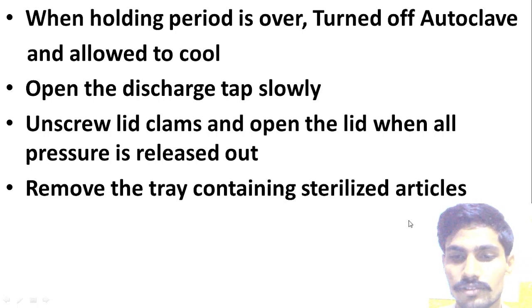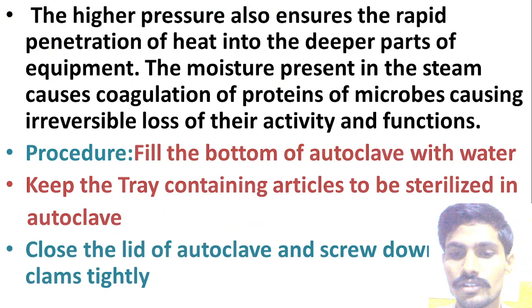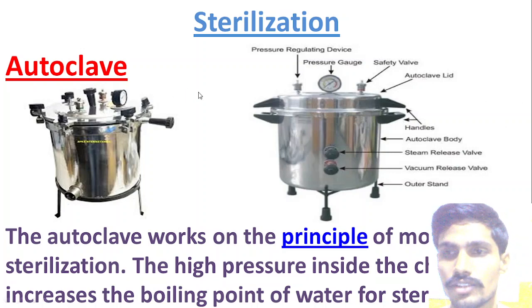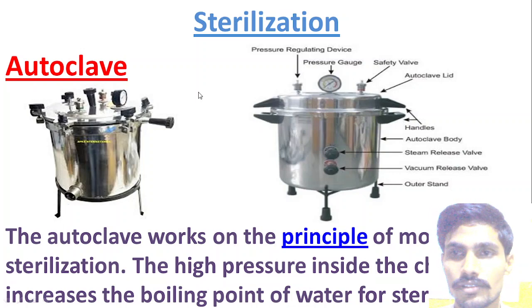Okay, this is about sterilization methods, that is the autoclave. Autoclave is an important sterilization method for your examination purpose as well as your knowledge purpose. I think you understand.